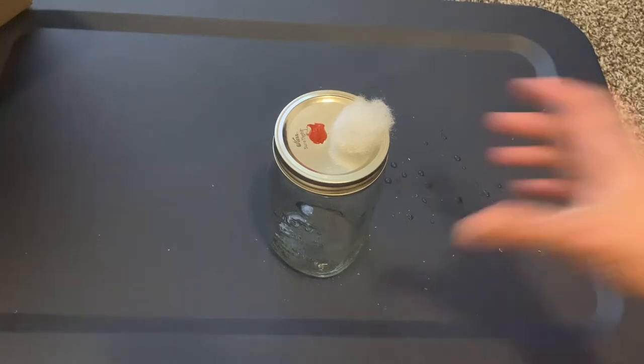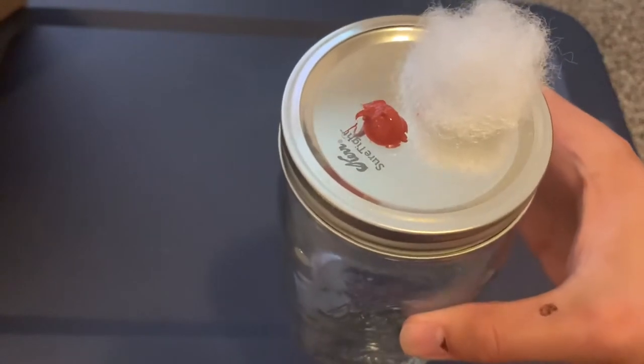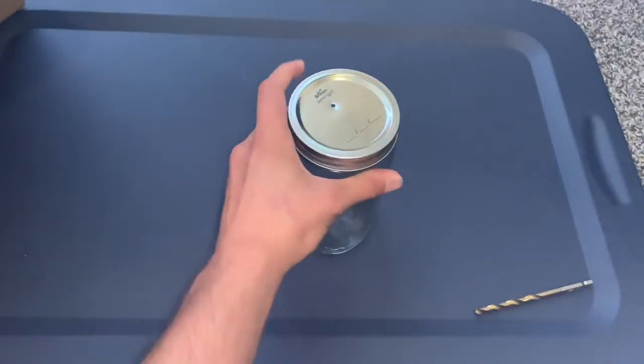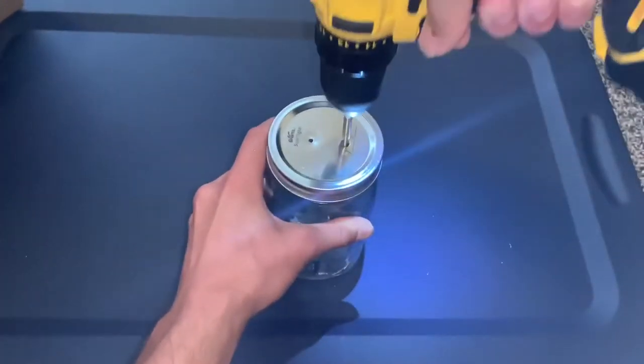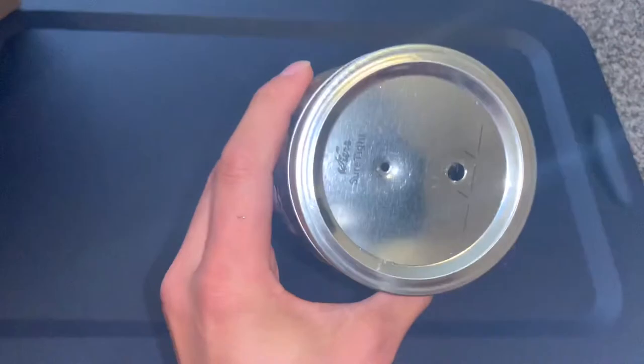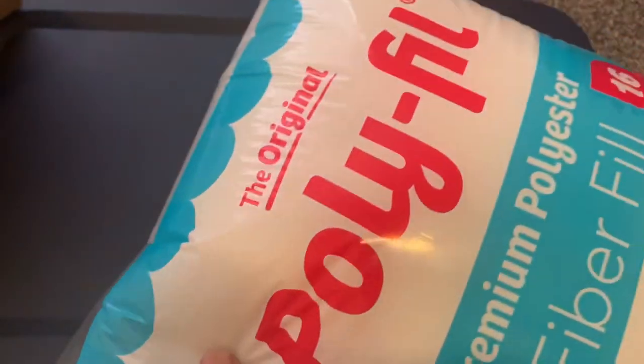Today I'm going to show you how to make filter jars with self-healing injection ports. First thing you want to do is drill a 1/8 inch hole and then a 5/8 inch hole in the top of your jar, and you're gonna want to get your polyfill.